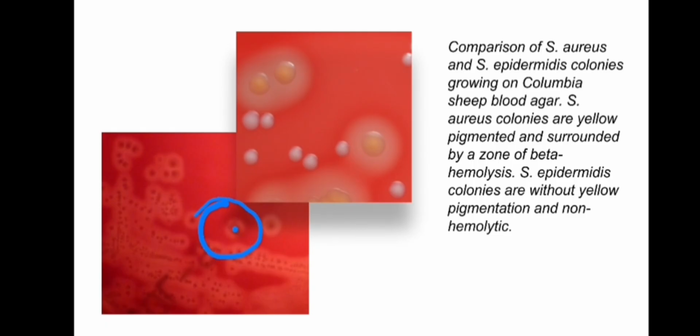So in the middle the black spot is a colony, and around it you can see a clear ring, right? So you can see the same pattern here and here. So this tells you the presence of hemolysis, so that the opaque agar plate is slightly becoming translucent in these areas due to the presence of hemolysis.